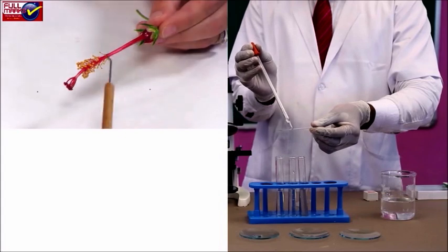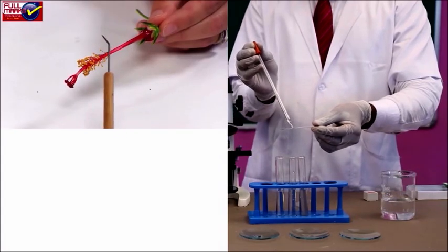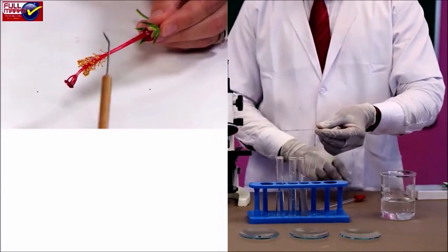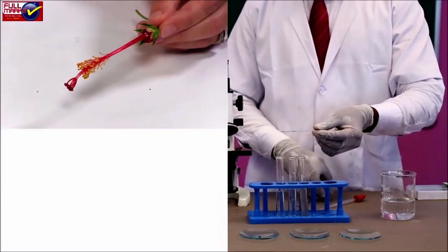Using a dropper, take some medium and put two drops of it on a clean glass slide. Now take a mature flower and dust a few pollen grains from its stamen onto the drop on the slide.